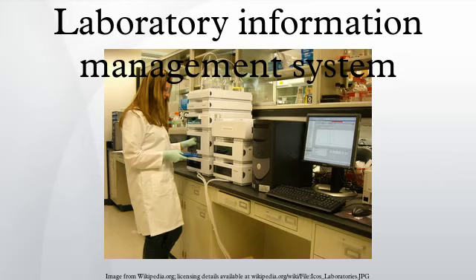Additional functions. Aside from the key functions of sample management, instrument and application integration, and electronic data exchange, there are numerous additional operations that can be managed in a LIMS.